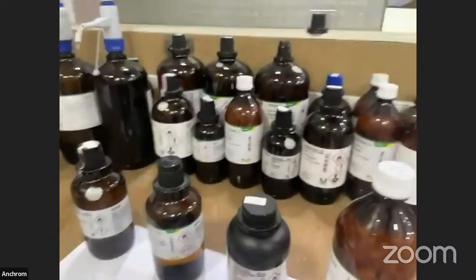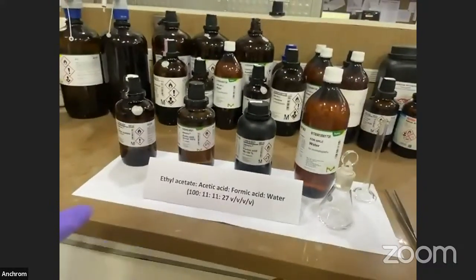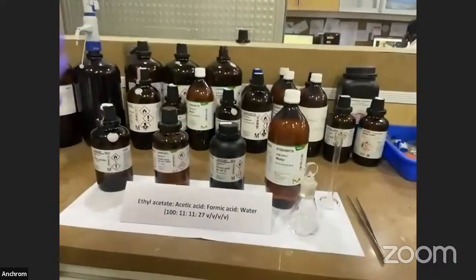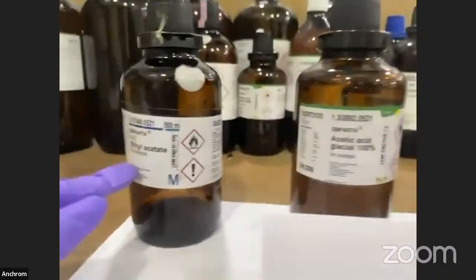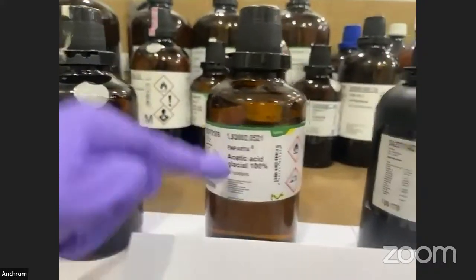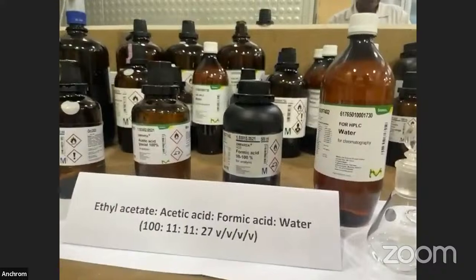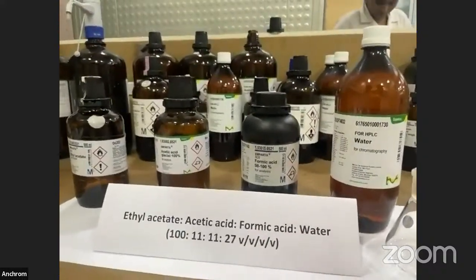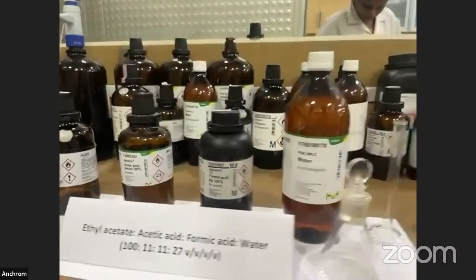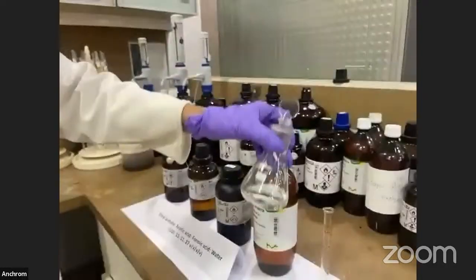Using this solvent, we will be preparing the mobile phase: ethyl acetate, acetic acid, formic acid, water. And this is the ratio for preparation of the mobile phase. So we have already prepared the mobile phase.